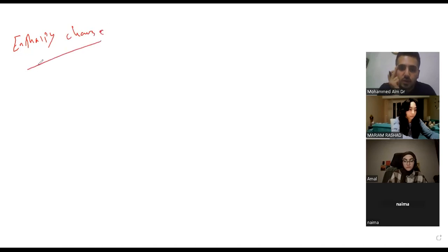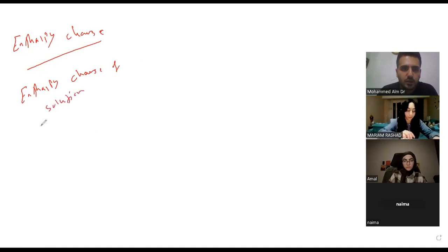So today our video or our class will be about measuring the enthalpy change, okay, measuring the amount of energy released or absorbed during the chemical reaction. The first thing we are going to start with is enthalpy change of solution. So guys, who remember what do you mean by enthalpy change of solution?